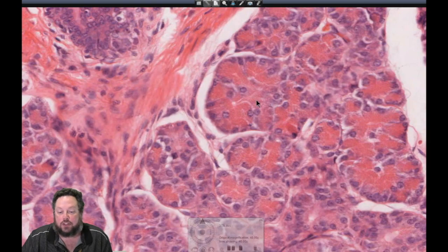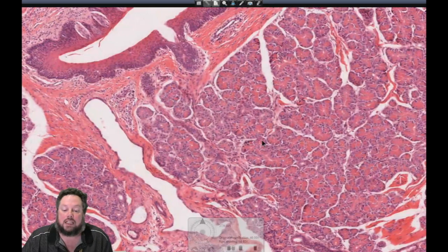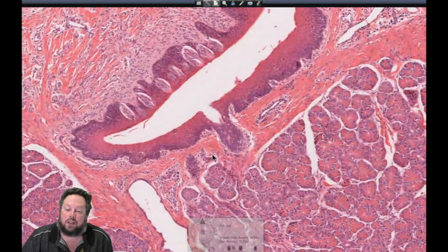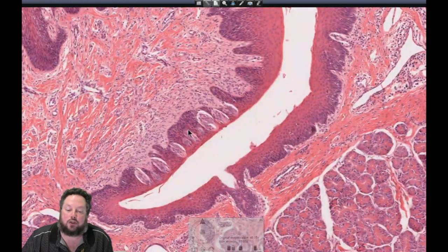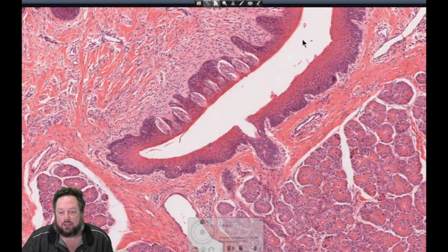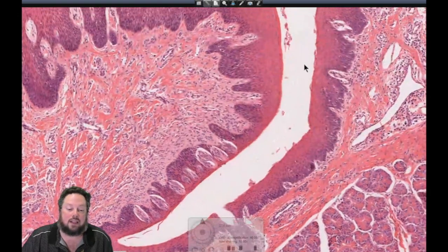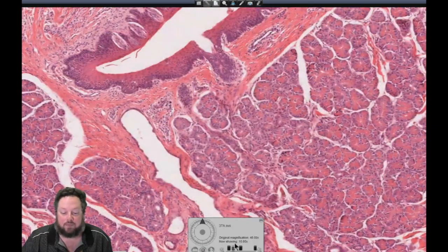Okay, so these are serous secreting glands. These are known as von Ebner's glands. These are responsible for the secretion of the enzyme lingual lipase, but they're also responsible for helping to flush out these crypts. Because if you imagine, if you have something to eat, it comes down into these crypts, it's tasted there, and then it can stick around because it's a relatively deep crypt. So these flush out these regions so that you're not tasting something 12 hours after you ate it, hopefully. And that allows new taste sensations to come in.